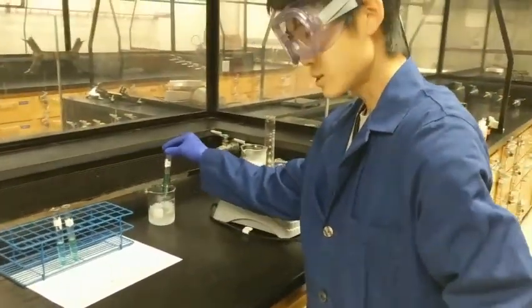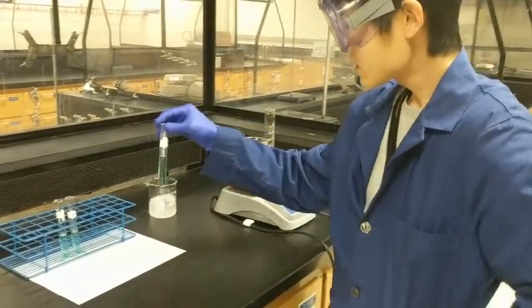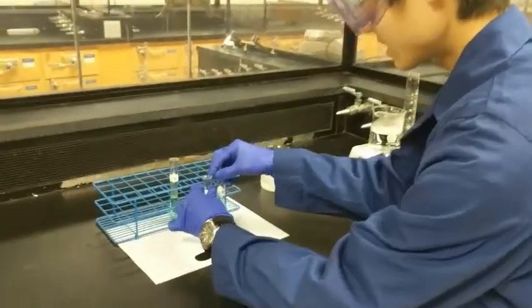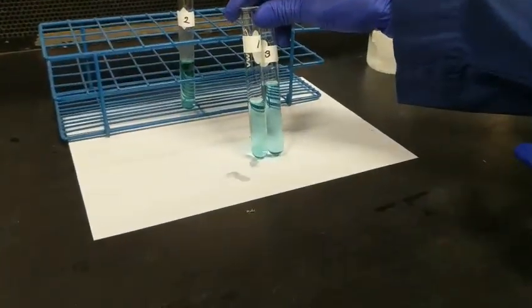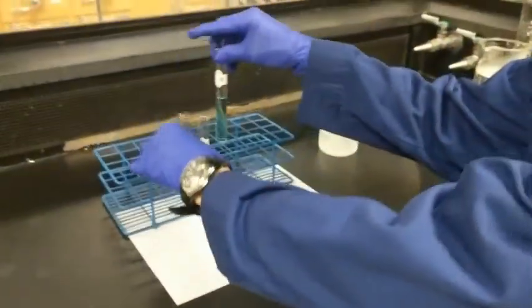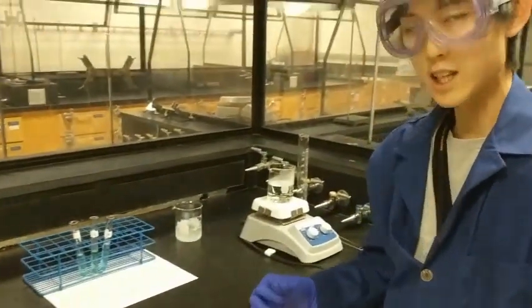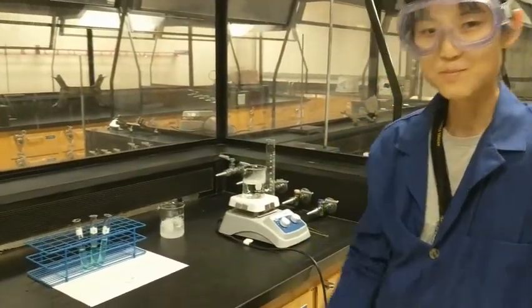And the third test tube, which was cooled in the cold water bath, should be slightly more blue than the reference. So please record the color and explain the change of the color based on Le Chatelier's principle.